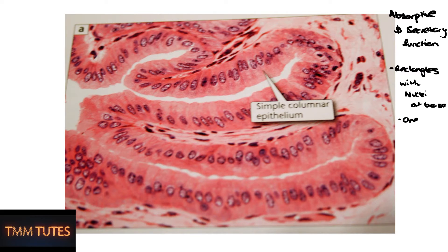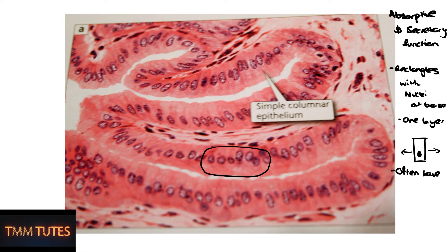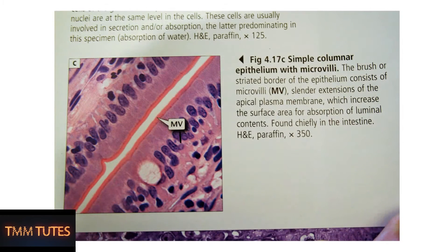Here's simple columnar epithelium. It's usually an absorptive or secretory type epithelium. It has rectangular cells with nuclei that usually sit at the base, in a single layer. You can see they still form the outer surface in that single layer, but they often have surface structures that specialize them to the tissue they're in.